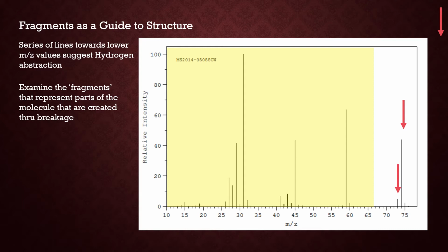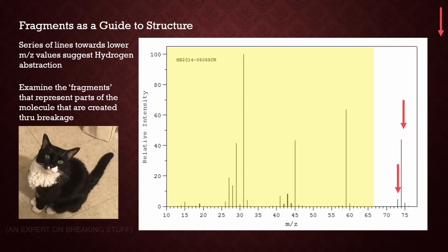They're not complete molecules, they're actually fragmentary ions, and try to figure out from the changes what they are.